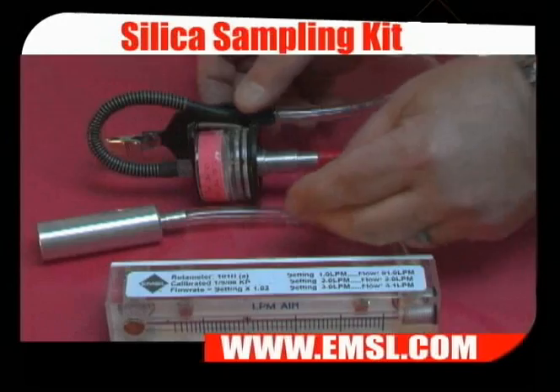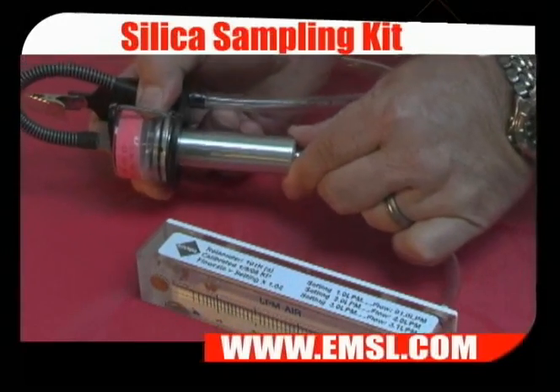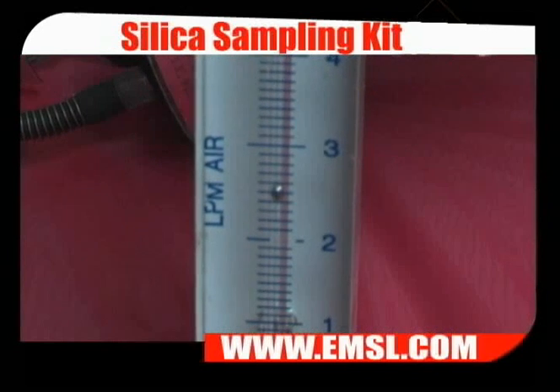To calibrate, attach the calibrator adapter to the cyclone and turn on the pump. Adjust the pump to a flow rate of 2.5 liters per minute.